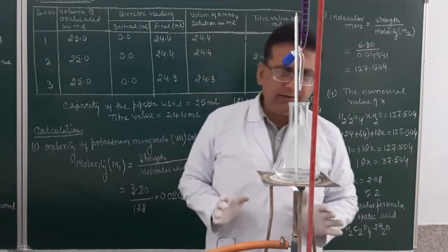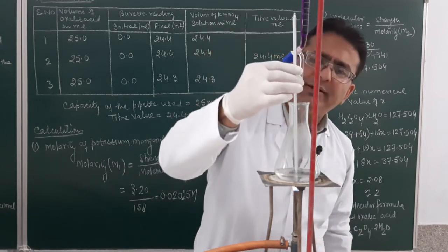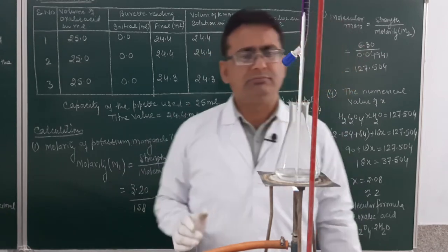You may see over here, I am heating this. I will be observing the temperature in the thermometer.